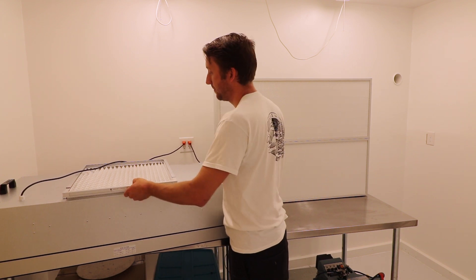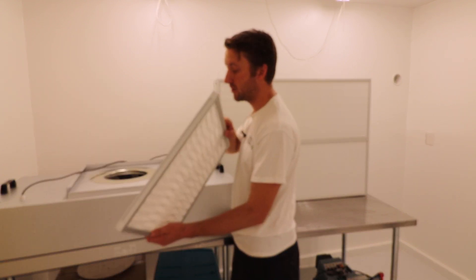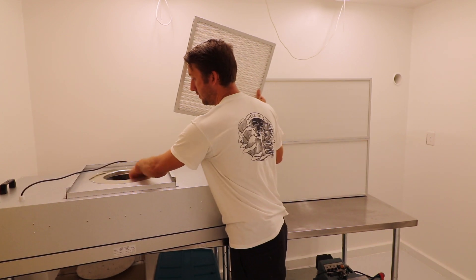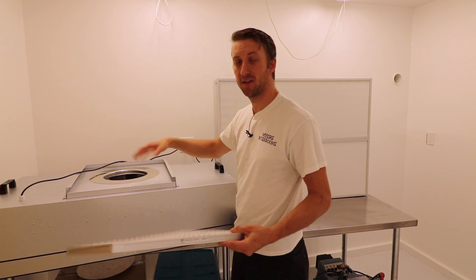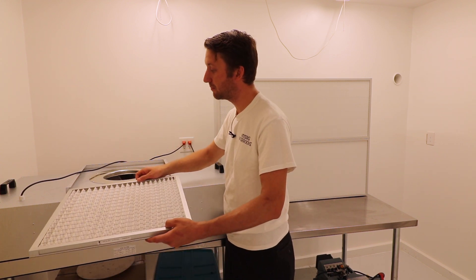Here's the backside. You have the filter, the motor, and the filter holder. The blades are metal, not plastic. Some of the cheaper fan filter units have plastic fan blades.